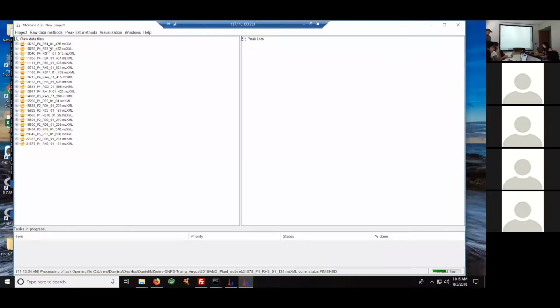I mean, it's fine. I can just follow. Yeah, and then you can continue with the backup files, which you can then download just through the web interface. Alright. Did you guys manage to download the stuff? That's our studio downloads. Then maybe you can work together with me.